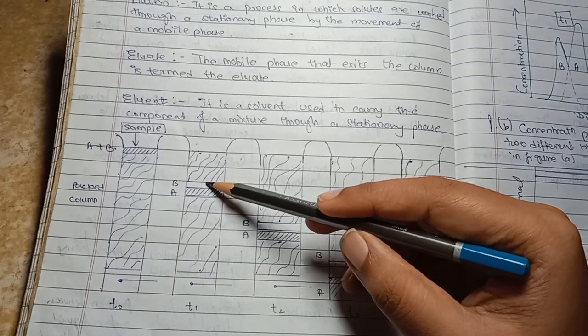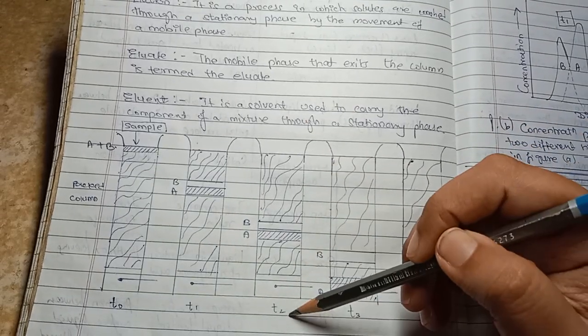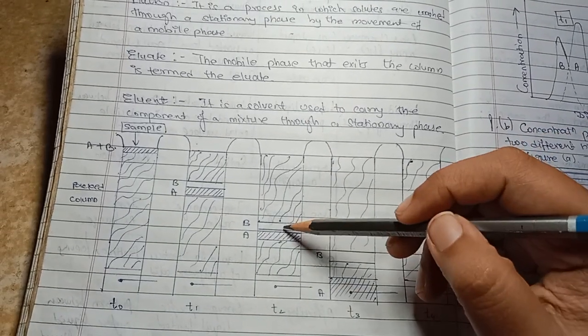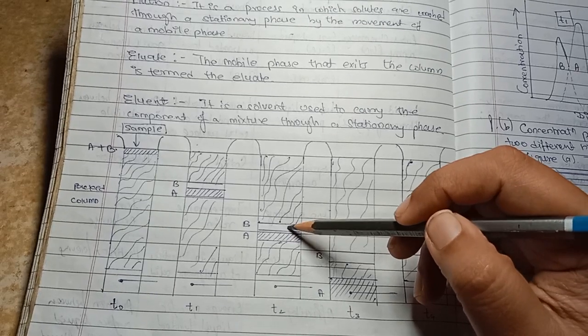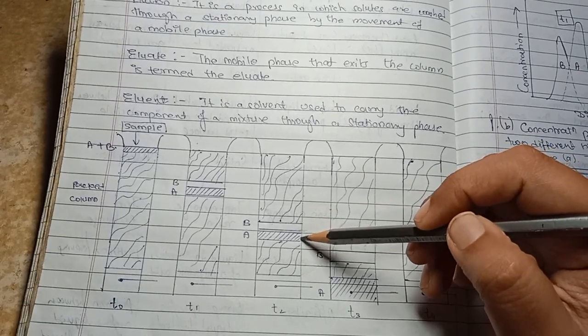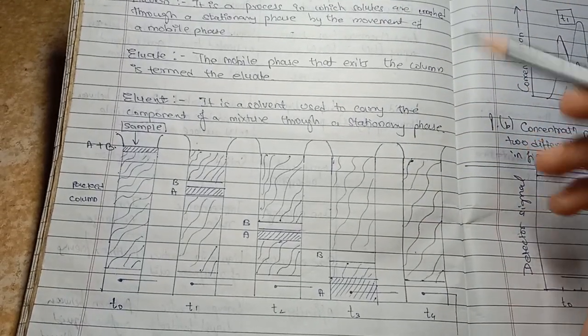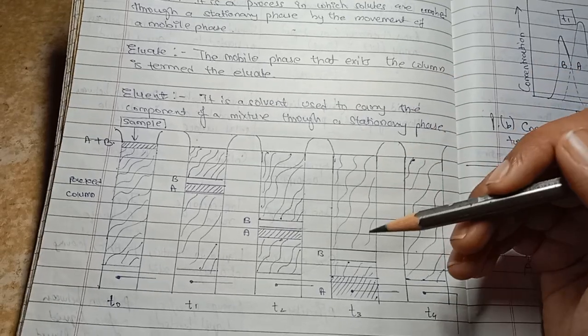At T1, A and B, these two different components, are divided. Later, after some time, these A and B components have some little space between them. That means they are getting separated.